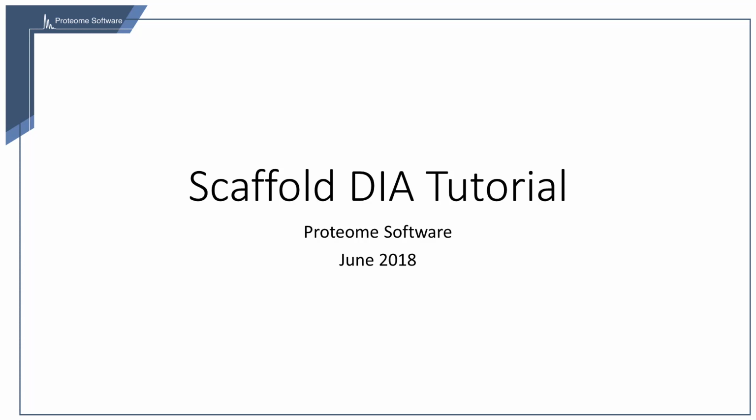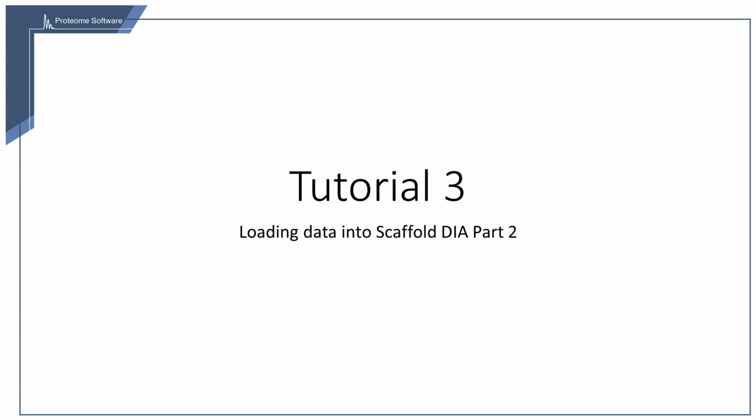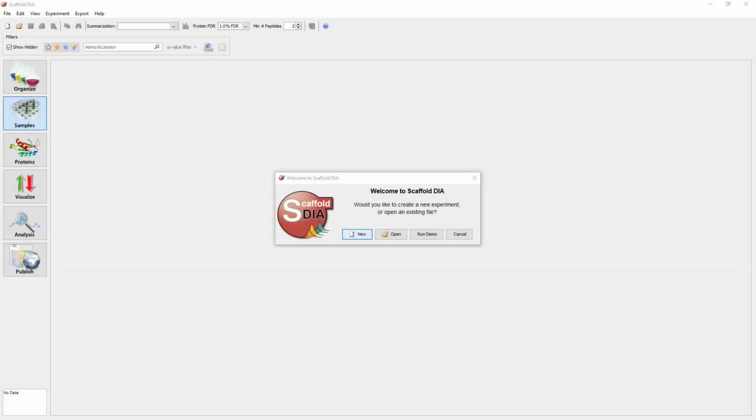Welcome to episode 3 of our Scaffold DIA video tutorial. This is part 2 of a 2-part episode on loading data into Scaffold DIA. This portion will delve into the second workflow. For information regarding workflow option 1 and general background info, such as explanation of file types, please see episode 2 of the tutorial series. This episode will only cover workflow option number 2.